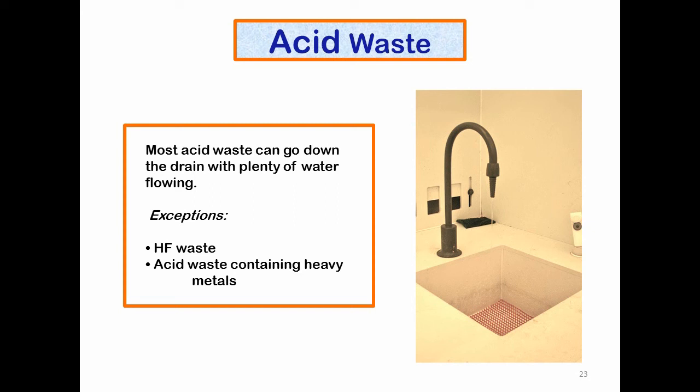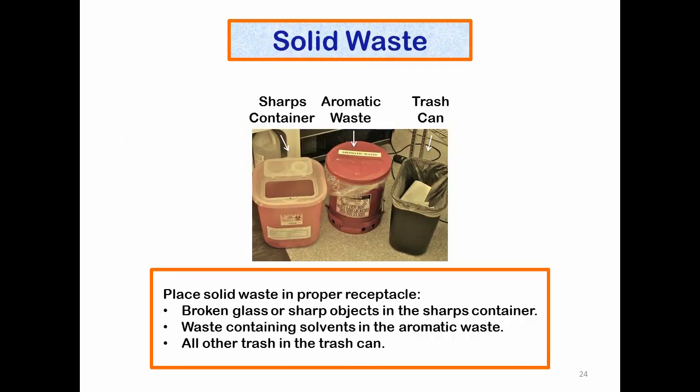For acid waste, most acid waste can go down the drain as long as plenty of water is flowing, with the exception of HF waste and acid waste containing heavy metals.